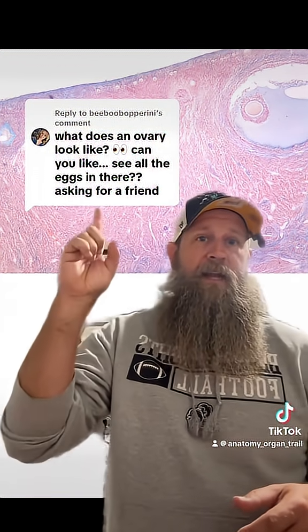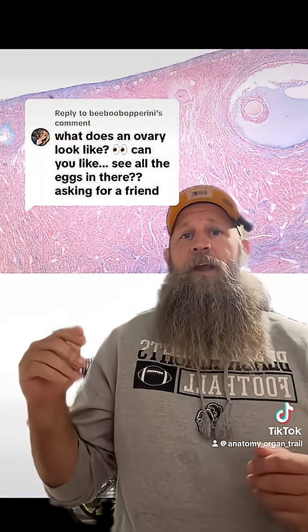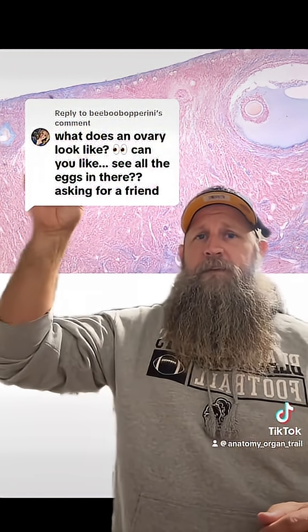That's what's behind me, and you can see all the eggs in there, and that's what these are. These are developing follicles or developing eggs, oocytes. And so there's going to be some primary follicles, which are off the screen over in this direction, right? But here we see a secondary follicle, a late secondary, early tertiary, and then this is going to be a tertiary going into what we call an antral follicle or Graafian follicle. This blue stuff here, this is the antrum, and that's what's going to provide some hormones to help the developing egg or the developing oocyte.